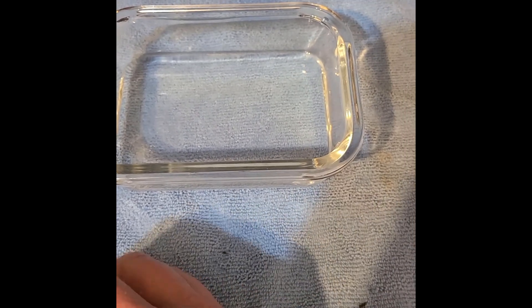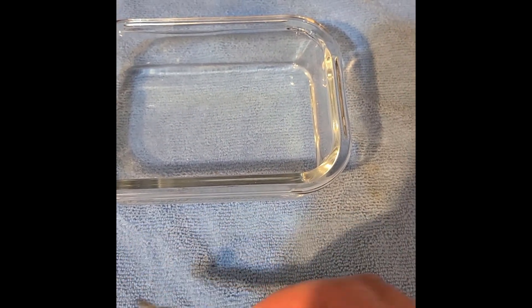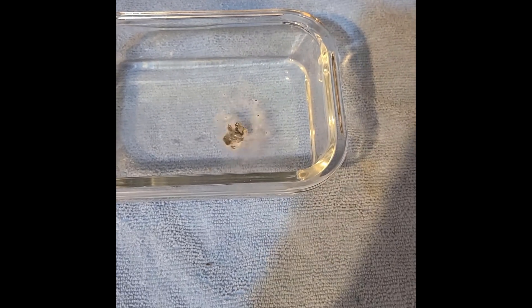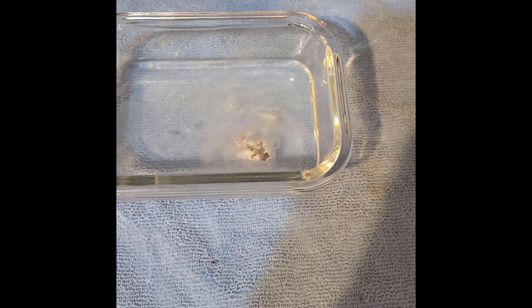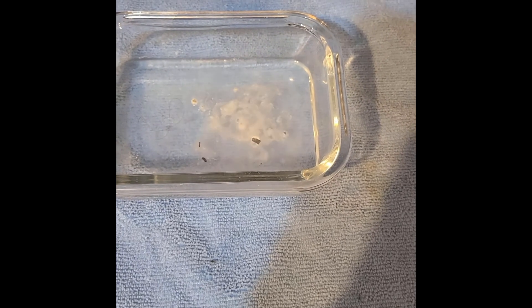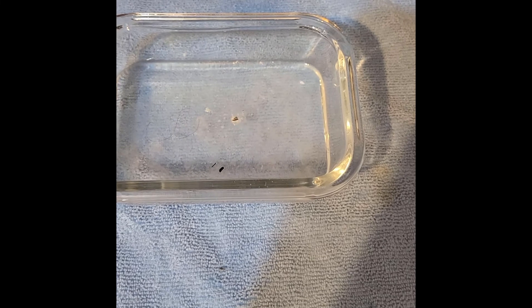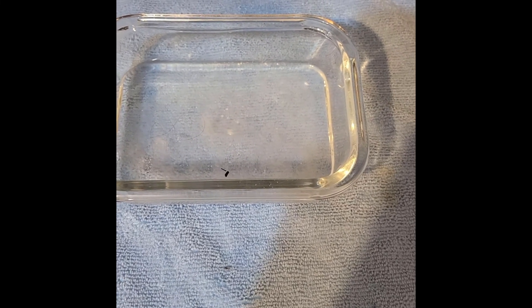Most everything seems highly water reactive. Let's try a bit bigger piece of the amalgam — not too big, as I'm not making this stuff just to waste it, and I actually don't want a fire. Nice. We now have a mechanistic pathway to fun chemicals. Until next time, friends.